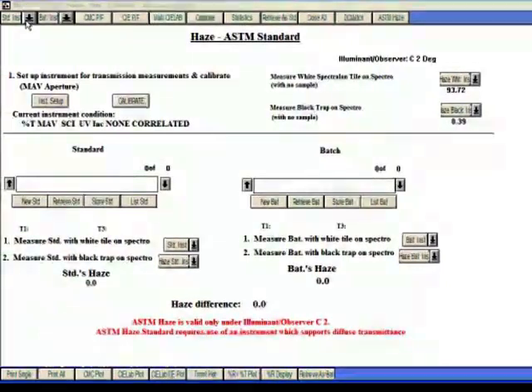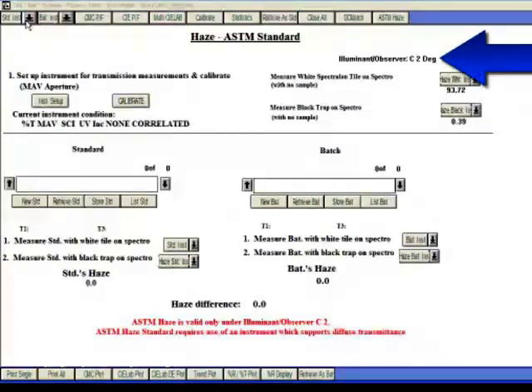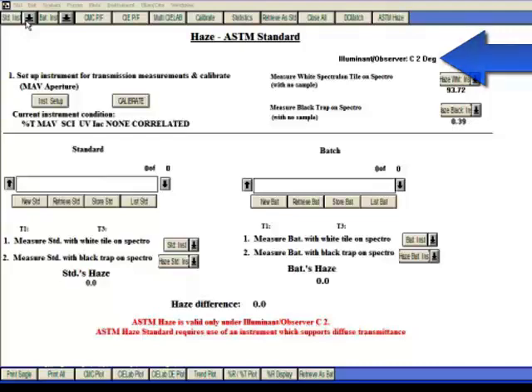In Tools QC, use the haze ASTM screen form. Set the primary illuminant and observer combination to C, 2 degrees. After you have calibrated your spectro for transmission, you are ready to begin.